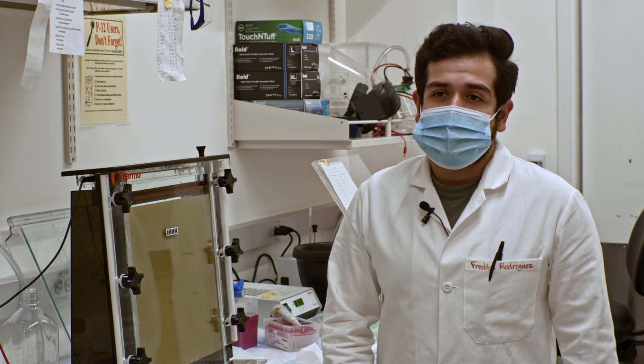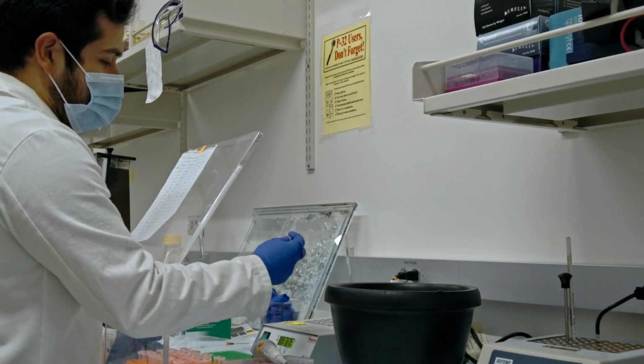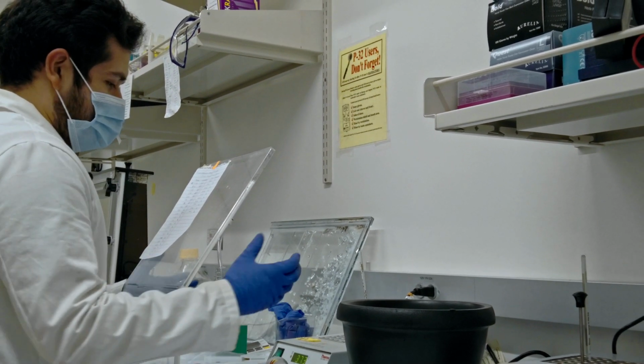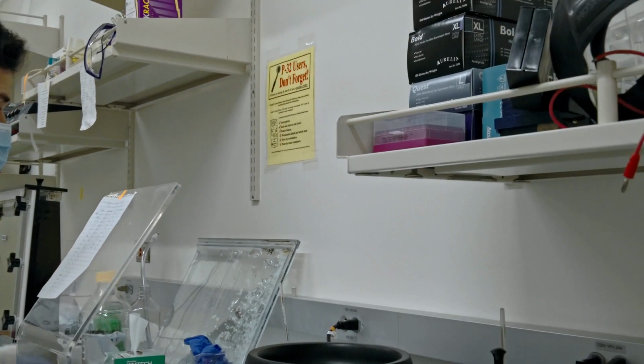So now that we've come back and taken your sample out of the freezer, you have your radio-labeled primer here. Now, whenever you do any sort of work that has any sort of radioactive material, make sure you're always behind this blocking screen.